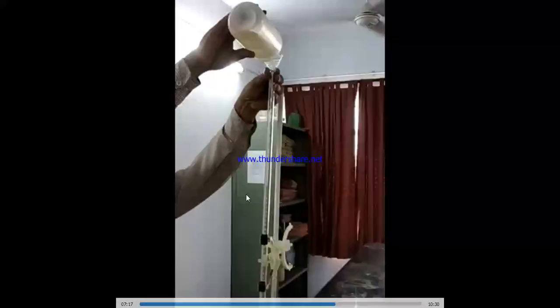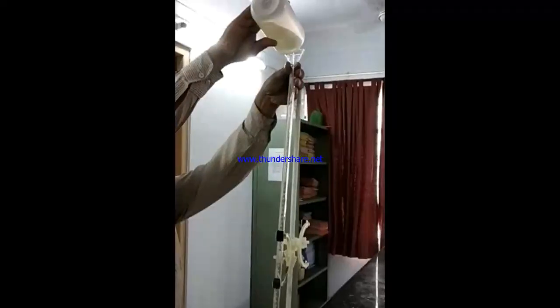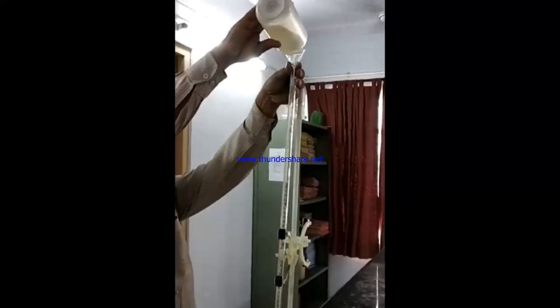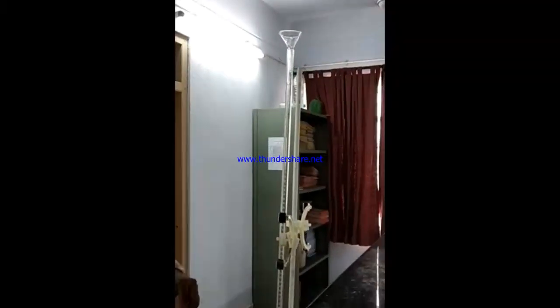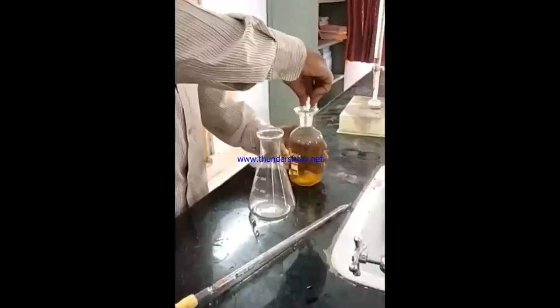Now we will put it into the burette. We will note down the initial volume, ठीक है.